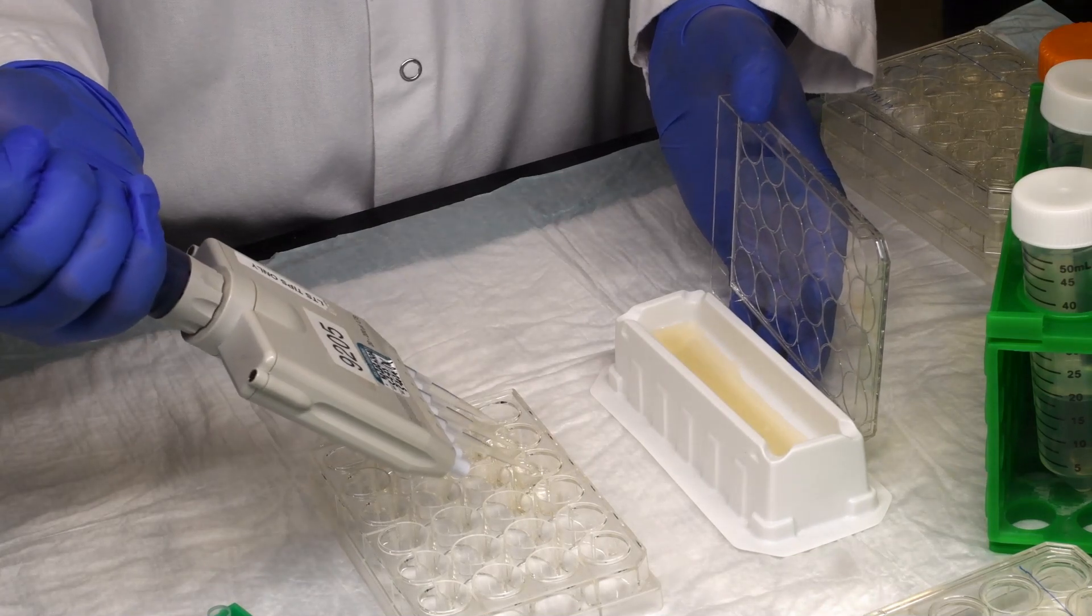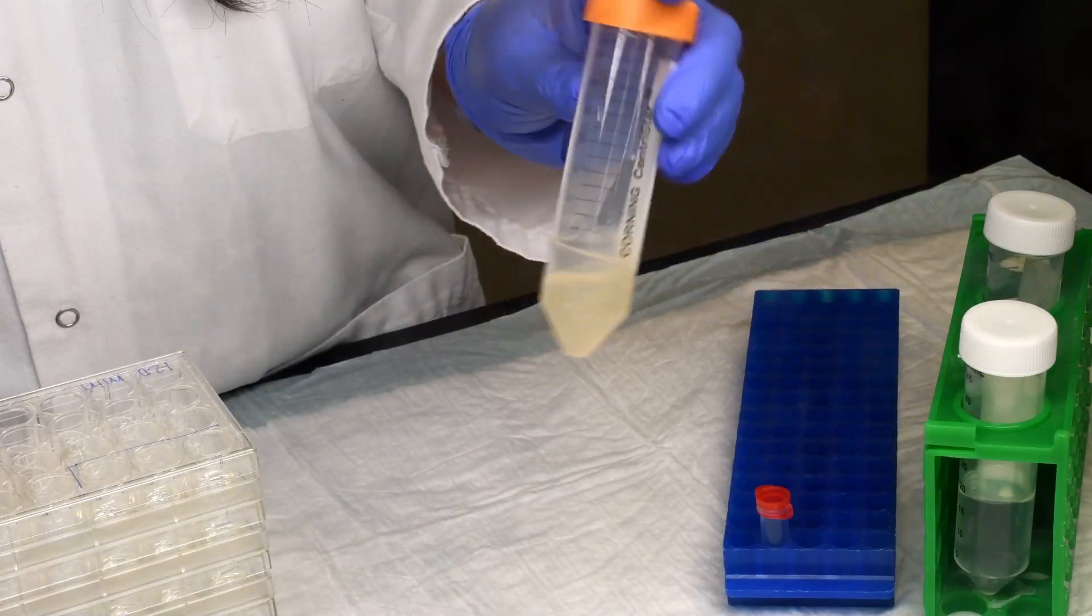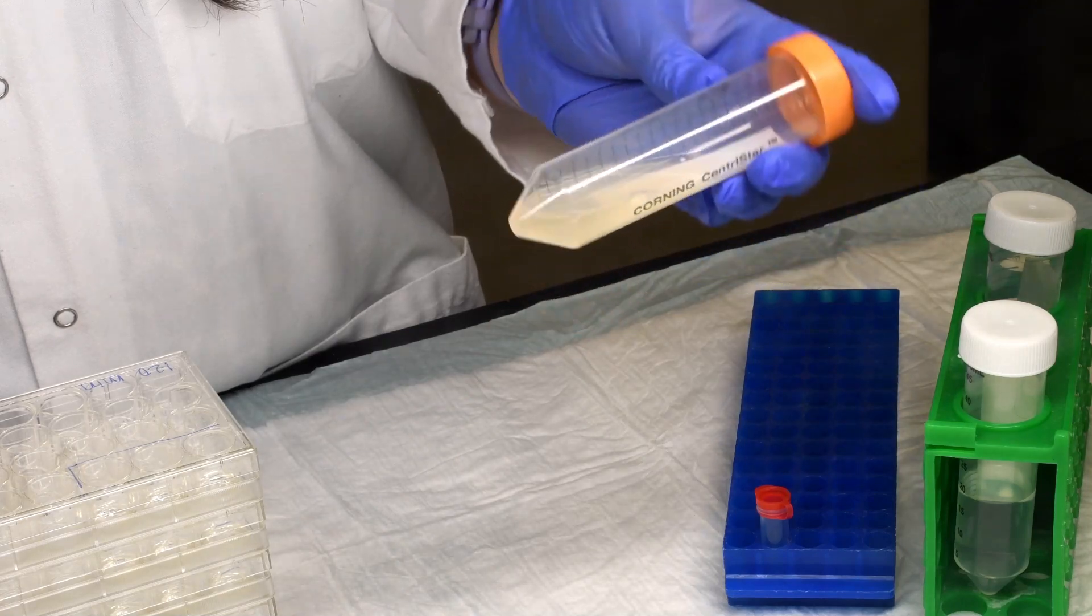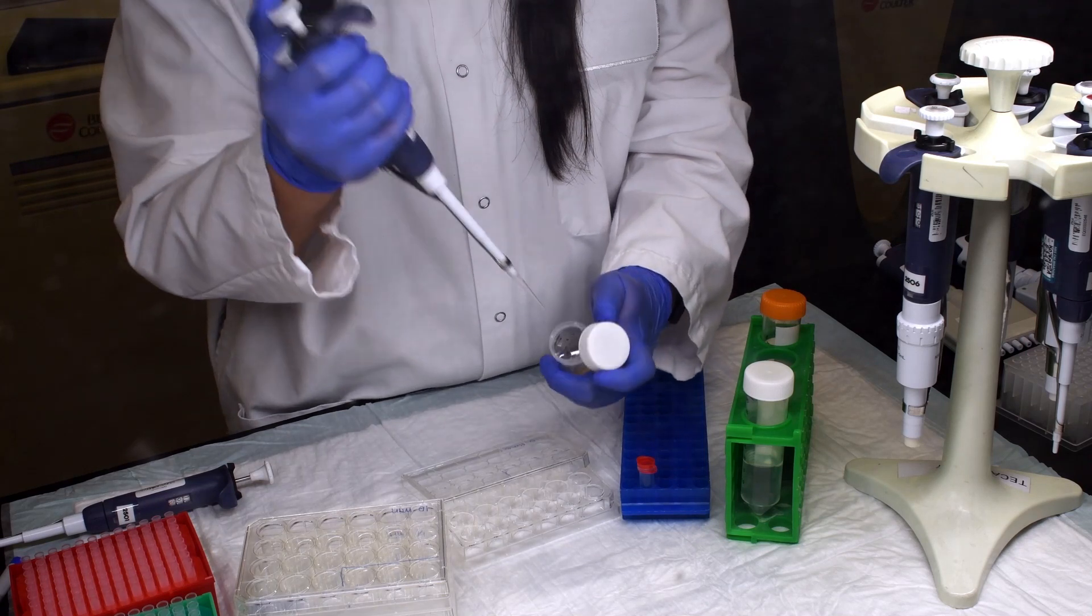For example, if you take various time points from a single incubation, extra care needs to be taken to ensure that the cells are homogeneously suspended in the medium before you take the sample to ensure that the remaining hepatocytes are equal across all treatments.